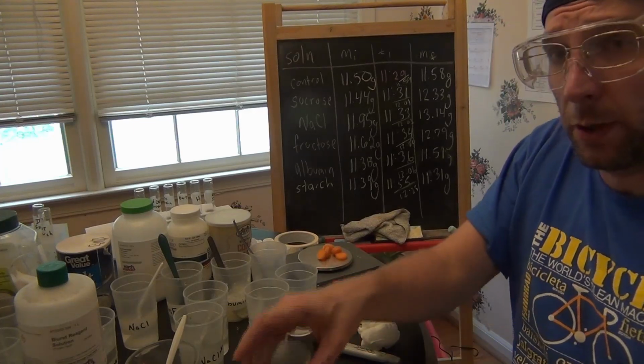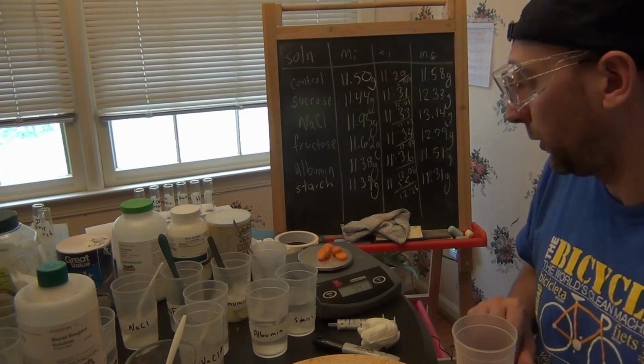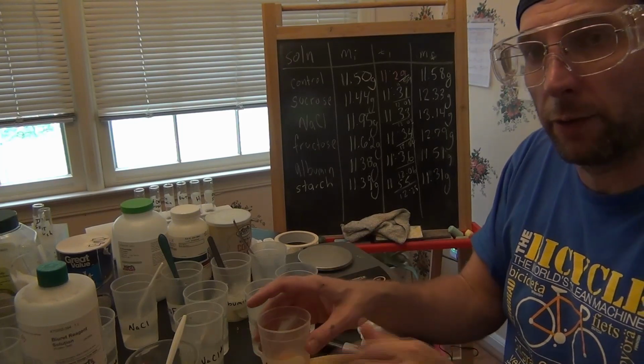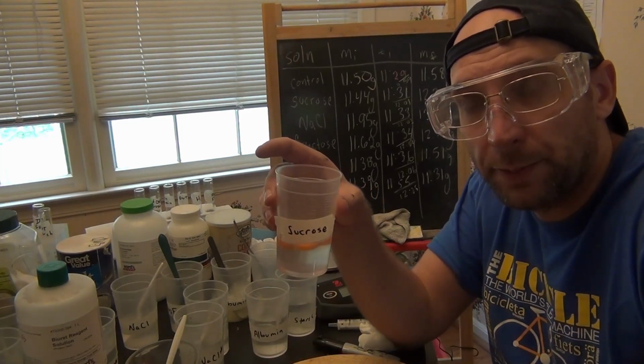Then I'm going to put them into different molarity concentrations of sucrose, and cover them with a piece of plastic wrap. And I'm going to let them sit overnight.